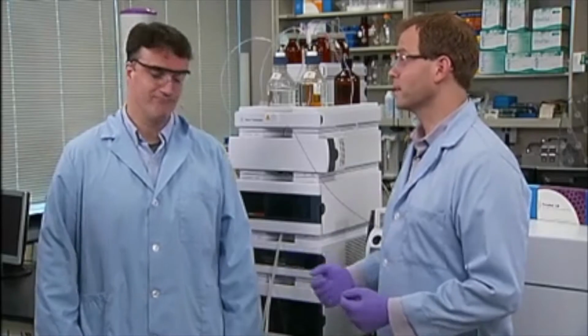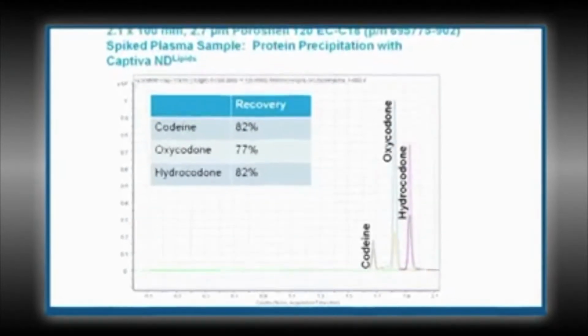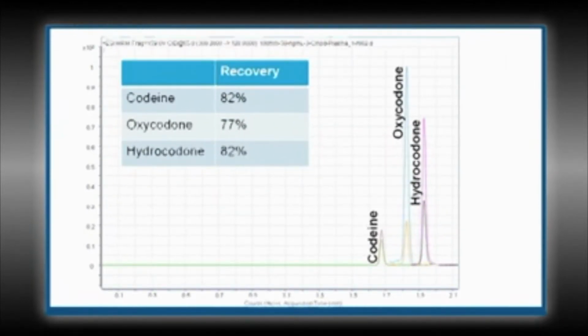It certainly does. Okay, so on screen I'll show you our chromatogram. We've already input our method into the Mass Hunter software and run our analysis. This method uses a gradient which allows for a faster, more efficient method, especially with many compounds. Here we're only analyzing 3 compounds. If you were doing analysis for a large number of analytes, for example, analytes which differ widely in polarity or molecular weight, the gradient becomes even more important.